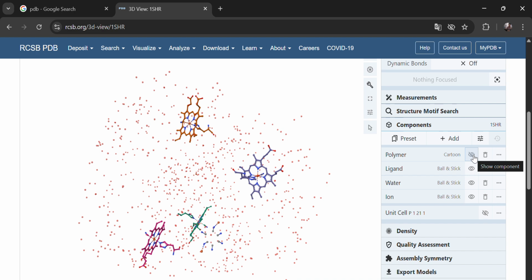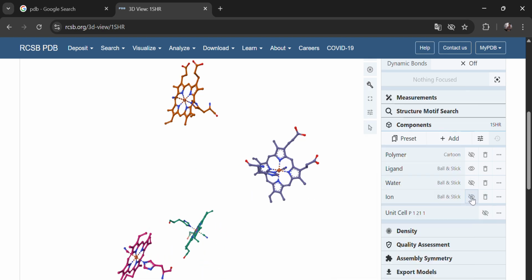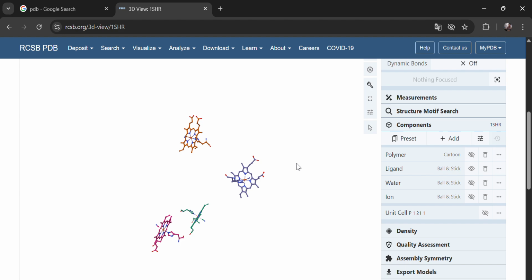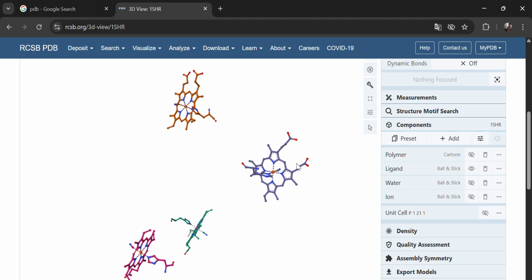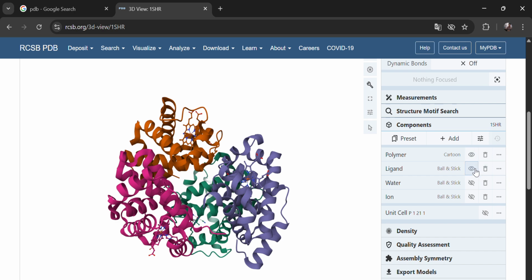So these are the ligands present in that. You can take a snapshot of that before going for PyMol or Chimera analysis. These are the ligands present in that. So water molecules and then ions. Okay, you can zoom by using your mouse, zoom it, you can see where it is. So you can see the polymer, which means the structure. Again, ligands, how many ligands are there in that, and water molecules, right? So ions. So that is the only one ion, I think.